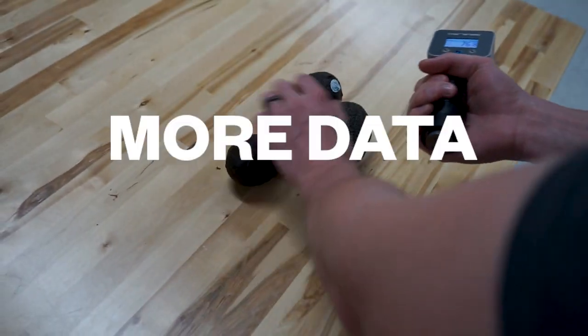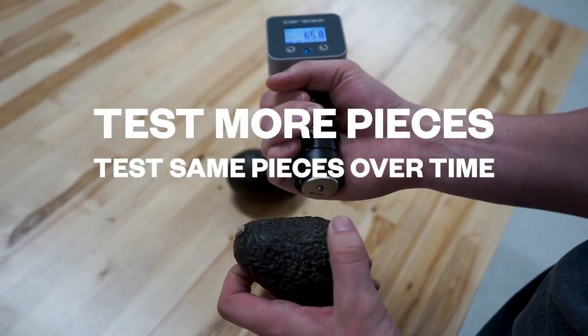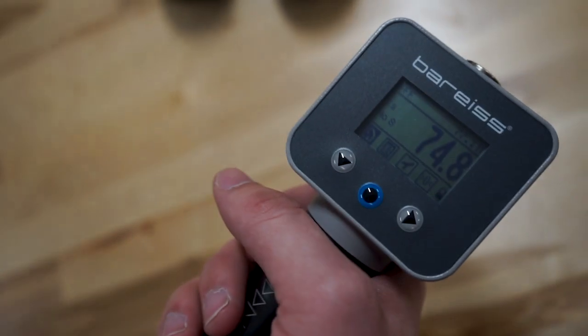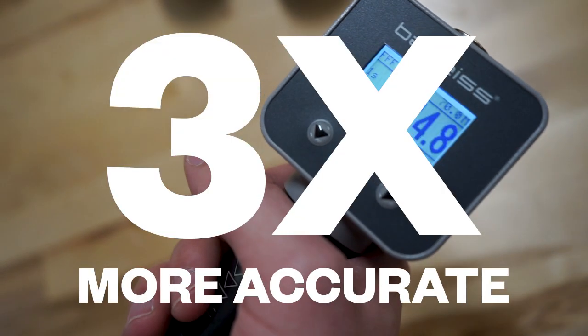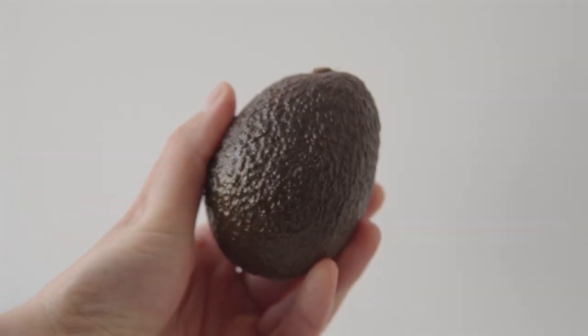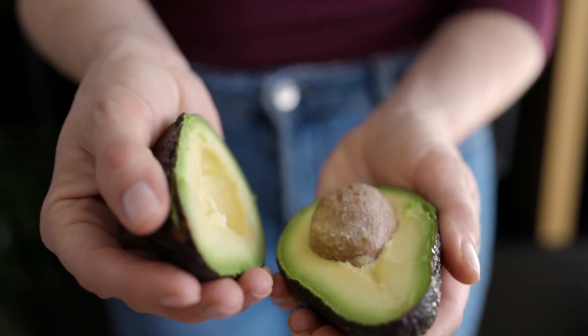This means you get more data and less waste, because you can test more pieces, test the same pieces over time, and, most importantly, sell it all. The durometer is also three times more accurate at measuring ripe avocados. This comes in handy, especially considering that more and more shoppers are looking for avocados that are ripe and ready to eat right away.